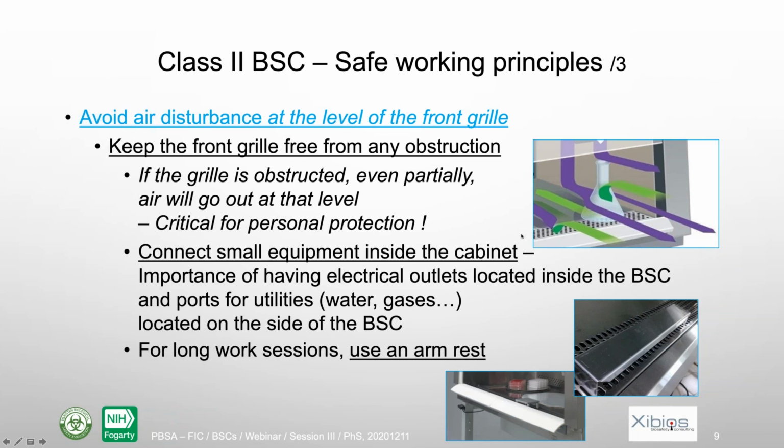Also, to avoid problems like having wires and so on here, we should connect all equipment inside of the cabinet. And that's why during the last session, I insisted that if you need to have some electricity outside or some water, gas, and so on, you should have some opening on the side, some ports on the side, so that you can have them inside without blocking the grille.